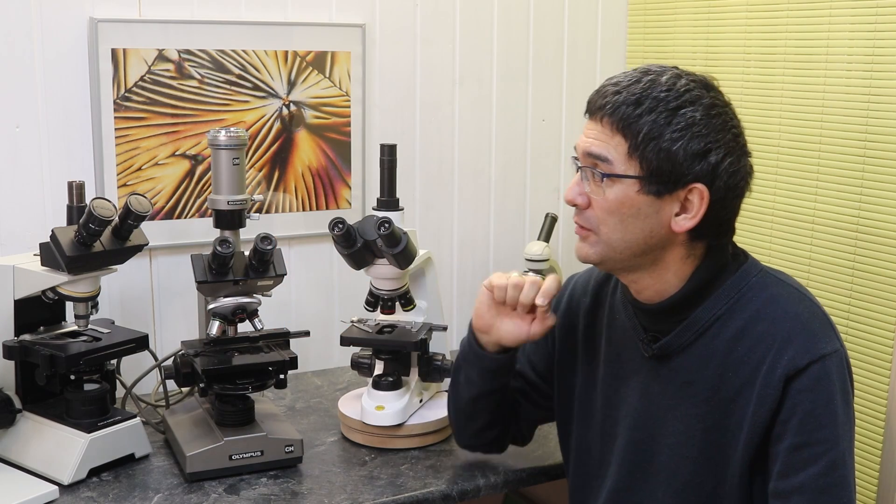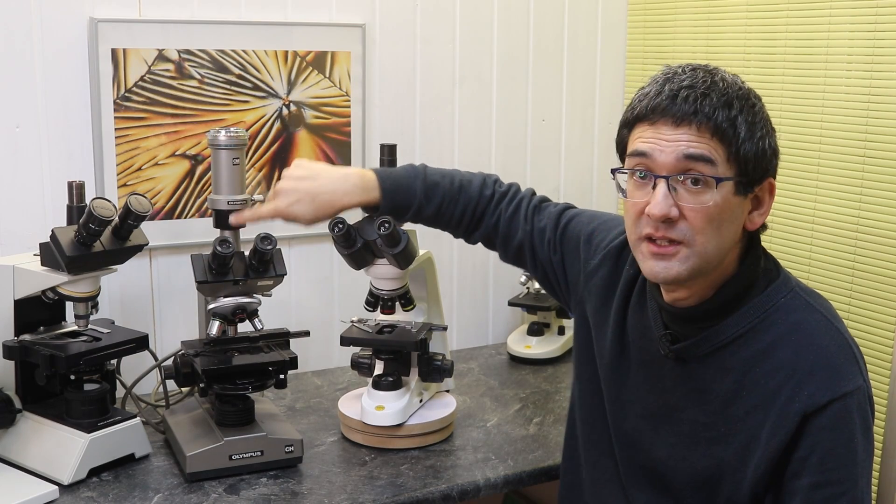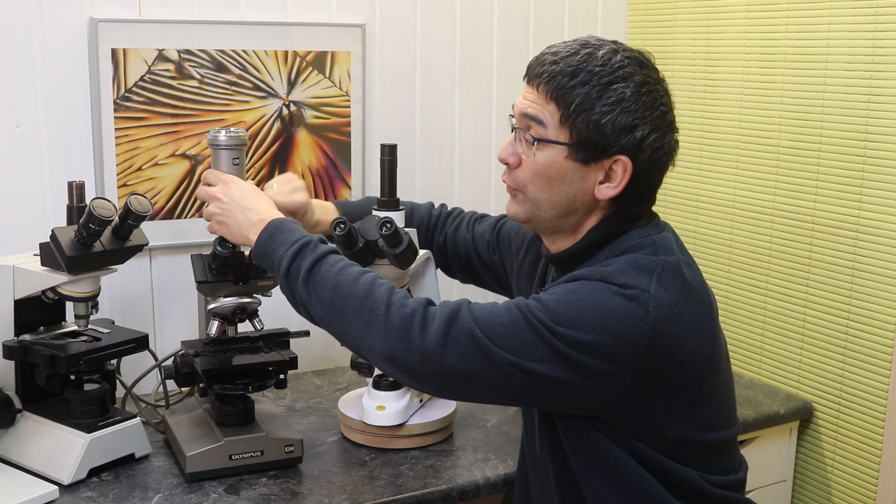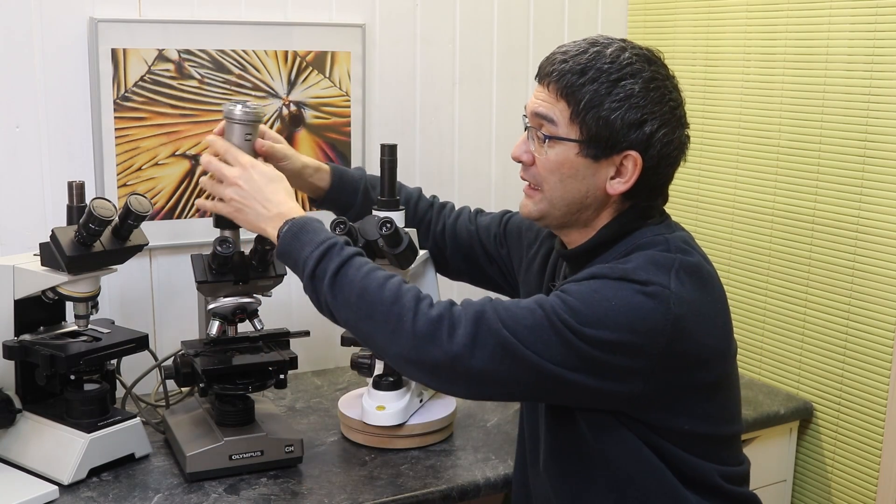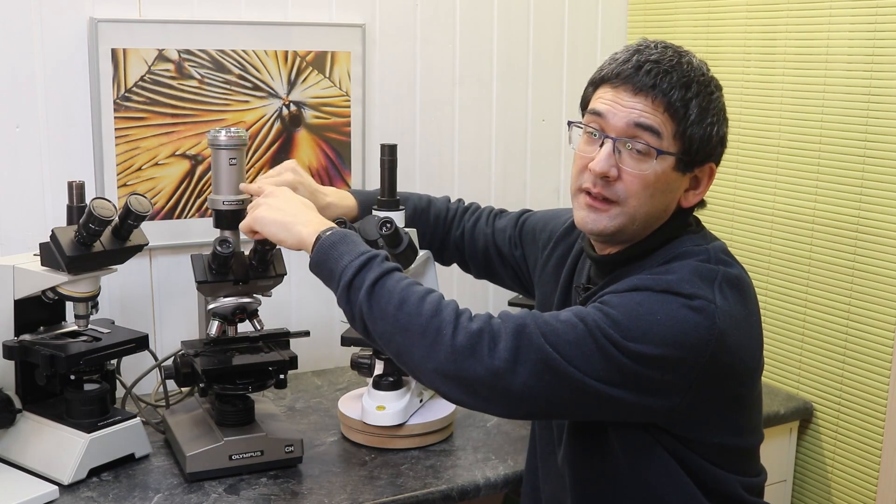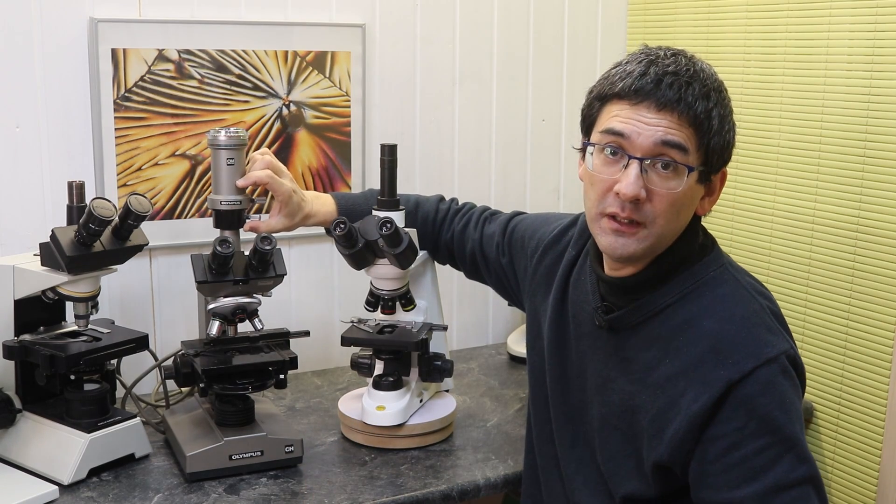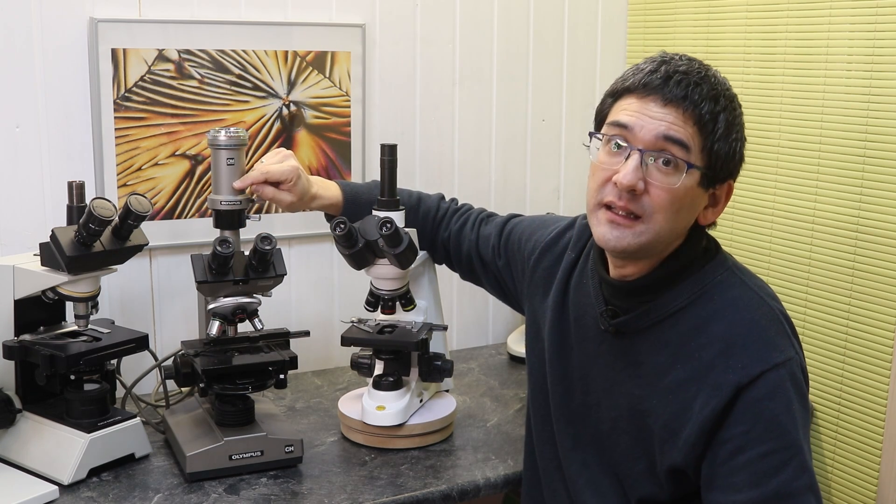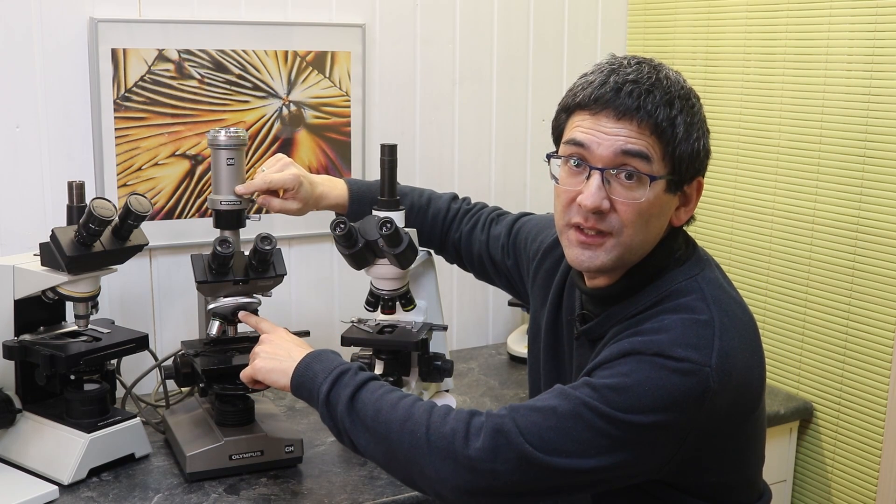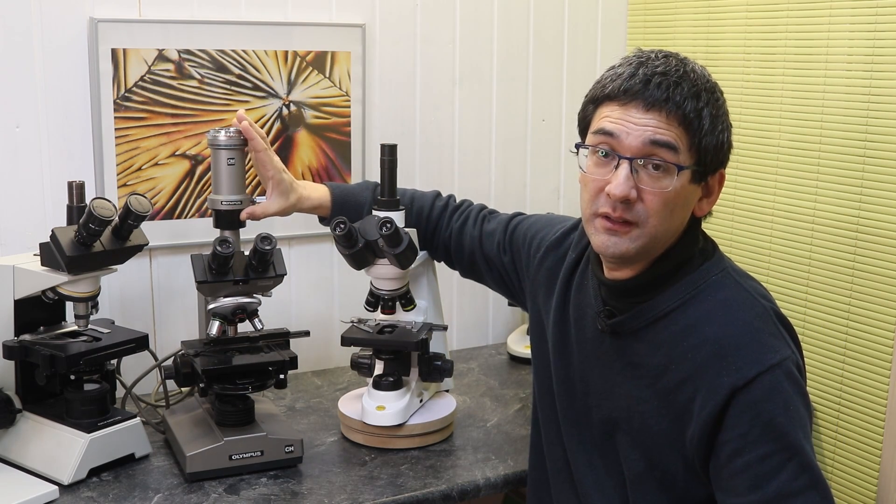Another direct advantage of a used model is this DSLR adapter. It's from the same company and contains a so-called eyepiece photo projection eyepiece. You can connect a DSLR camera here on top. This is a system that was designed by the company and those eyepieces, those projection eyepieces, are so-called compensating eyepieces. This means that it corrects the lens errors that the objective produces. So you're getting a really good image quality.